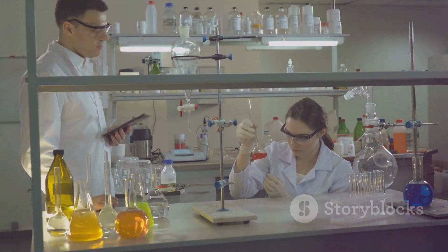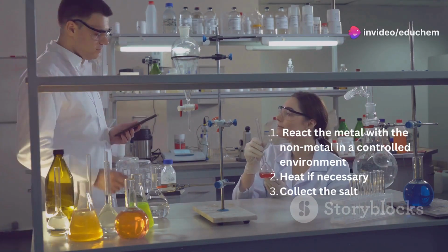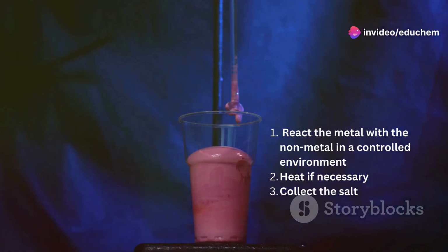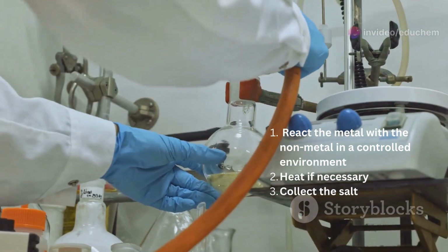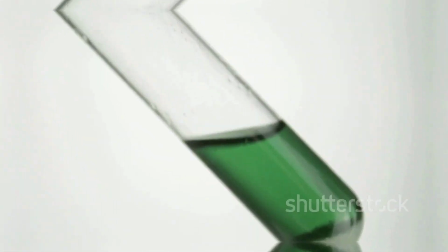The steps are as follows. React the metal with the non-metal in a controlled environment. Heat may be required. The salt forms directly from the reaction. If necessary, purify the salt by sublimation or recrystallization.